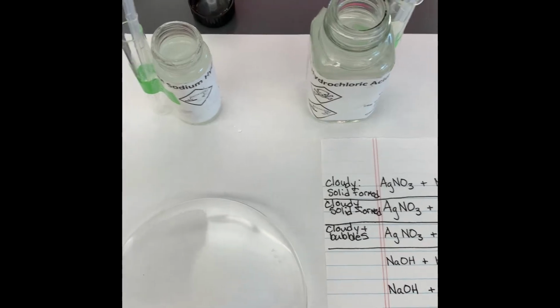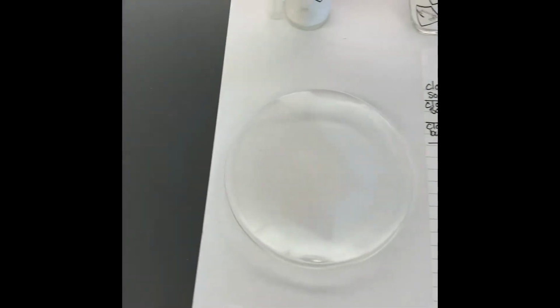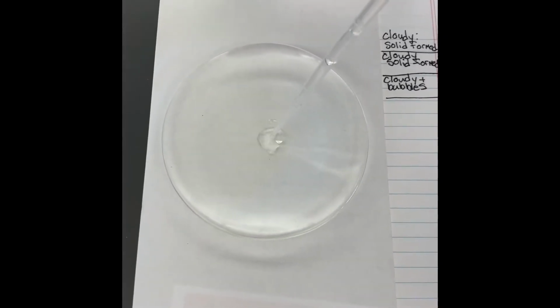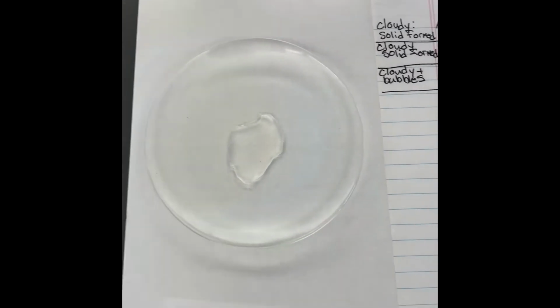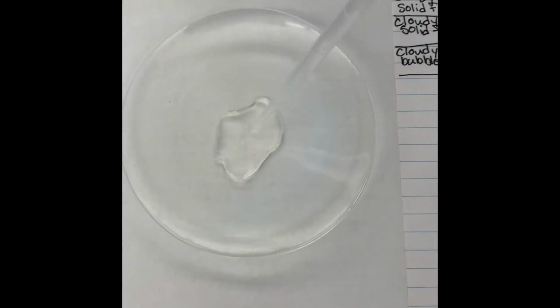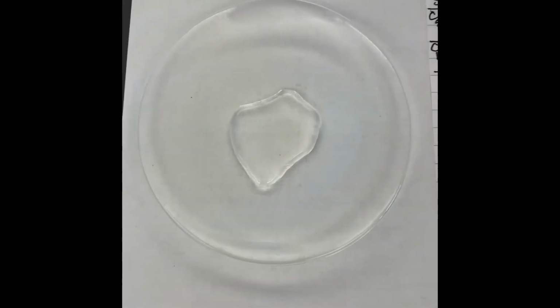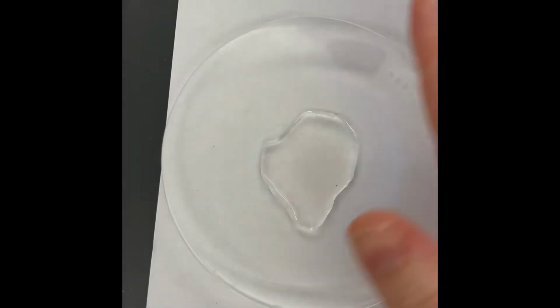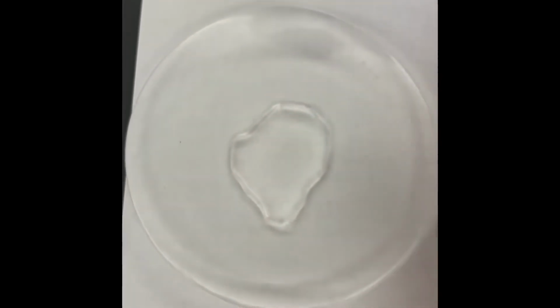Let's note that both of these solutions are clear and colorless. Now it looks like nothing happened, but I can actually feel some heat coming off of that.